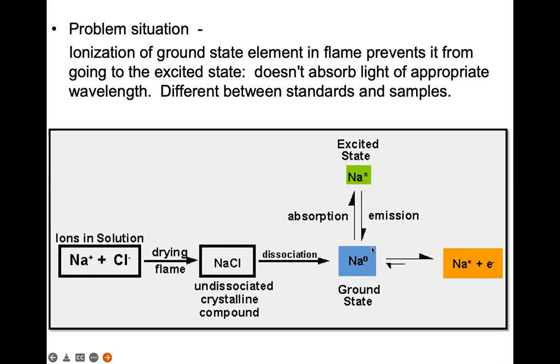So the intensity of the absorption spectrum will not represent the actual concentration of the sodium or the samples that we analyze, because now there is interference from ions absorbing the energy.